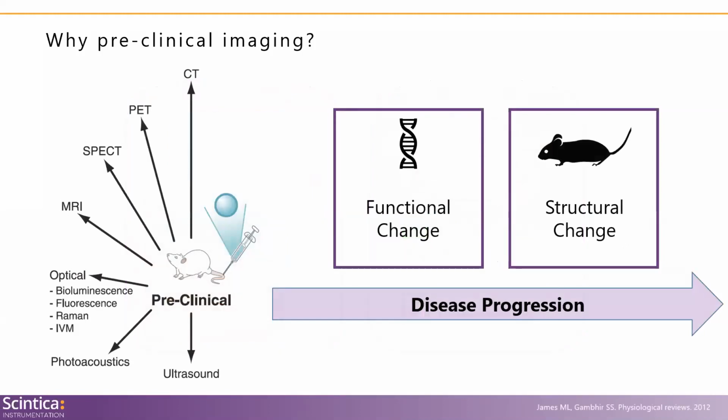And so preclinical imaging modalities have really become crucial for scientists to observe these changes, either at the organ, tissue, cell, or even molecular level. In most cases, functional changes will occur much earlier than structural changes. And so non-invasive imaging has really enabled this longitudinal investigation to better understand the natural progression of disease.